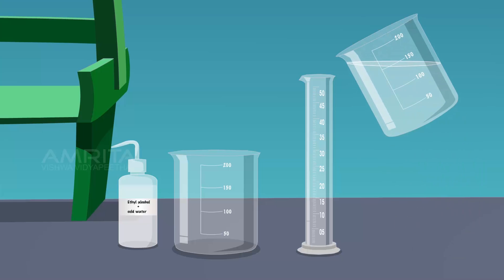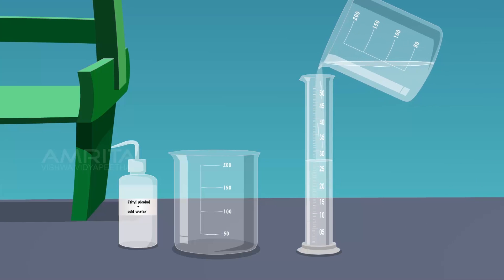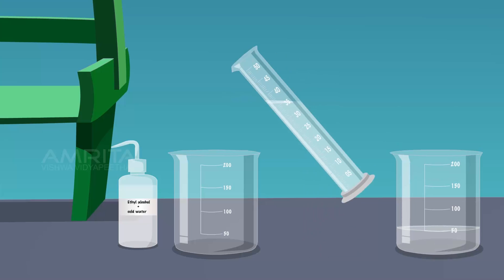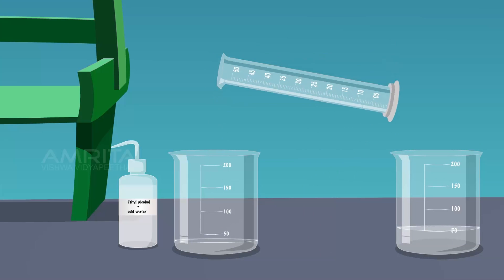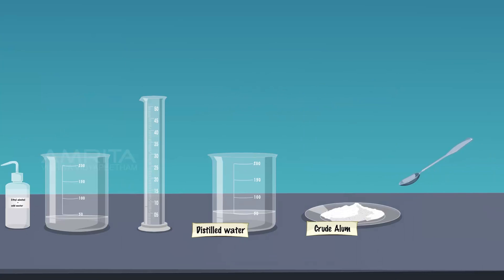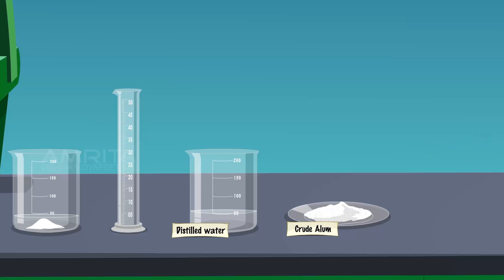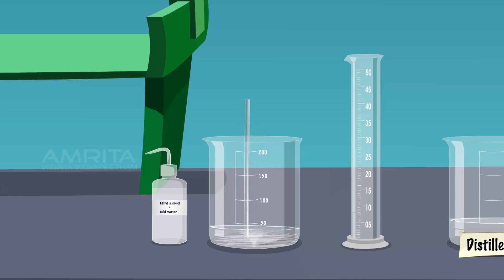Take 30 ml of distilled water in the measuring cylinder and pour it into the clean beaker. Take a small quantity of powdered crude sample of potash alum using the spatula. Add the crude sample of alum into the beaker containing distilled water. Stir the contents of the beaker well using the glass rod to dissolve it.